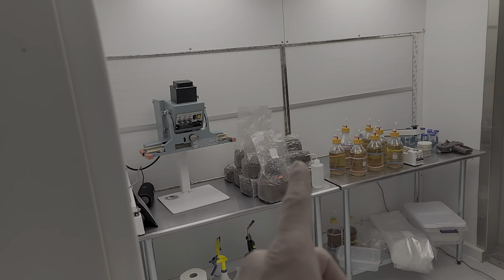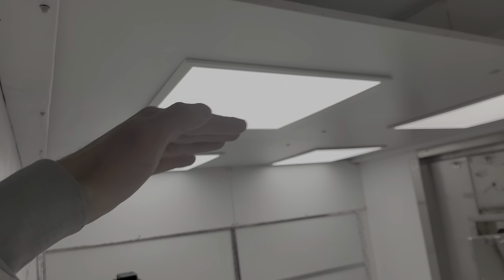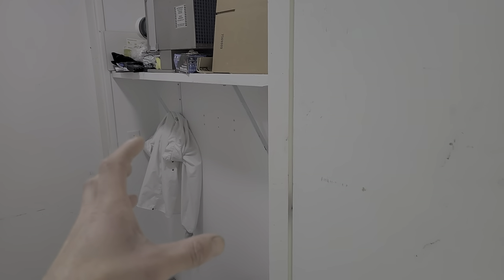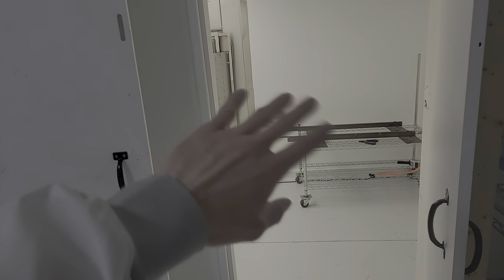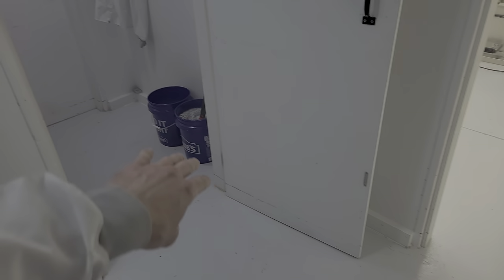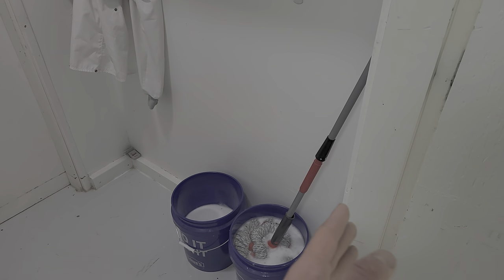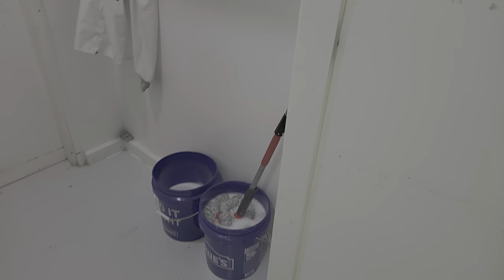You can also see we have the positive pressure HEPA unit. This is actually blowing in behind the wall of flow hoods — that's a false wall about a foot and a half to two feet out — so it's getting positive pressure in here, flowing out through any cracks, and a lot of it redirecting through here. We also have mops: a dirty mop bucket and a clean mop bucket.